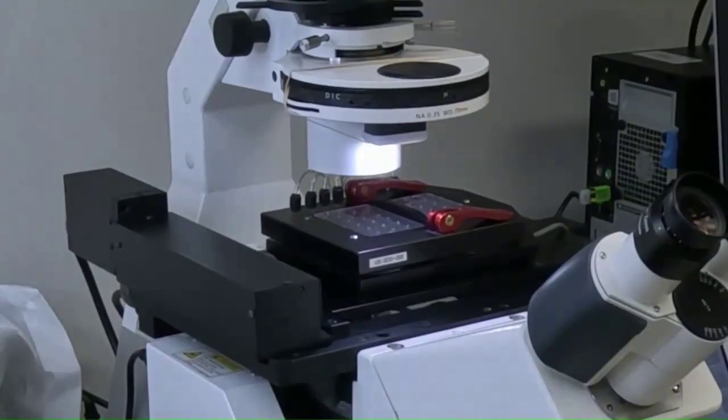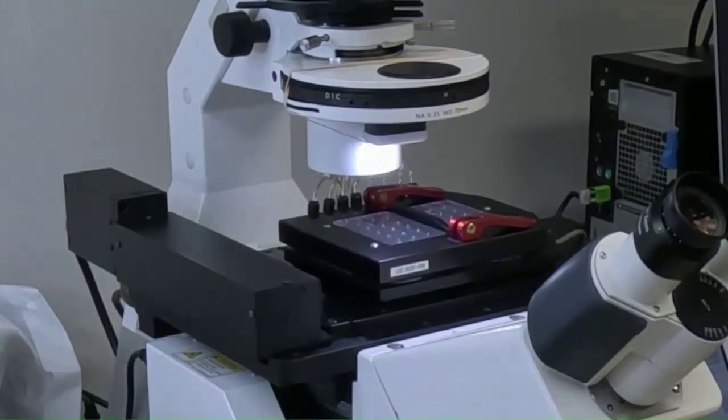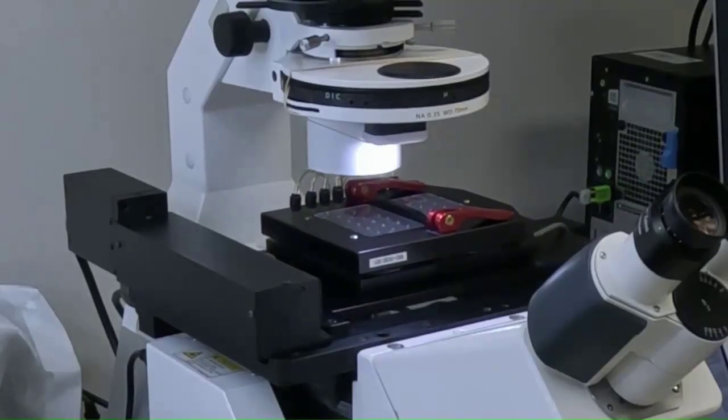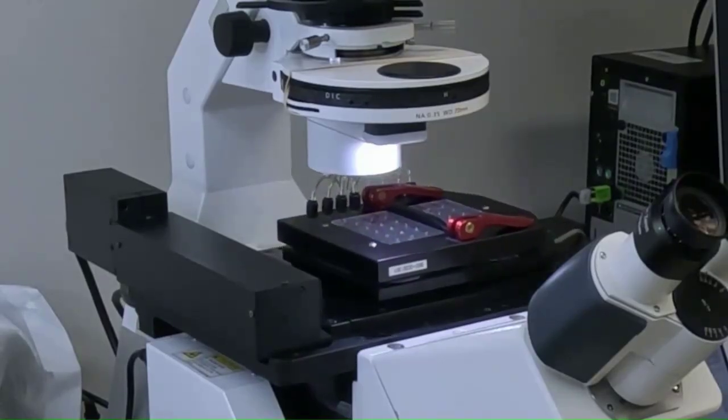In our lab, we have a Bioflux 1000Z that is equipped with a Zeiss AxioObserver inverted microscope that has a motorized stage. With the motorized stage, image acquisition through the various viewing windows is automated. And now we will proceed with a live demo.